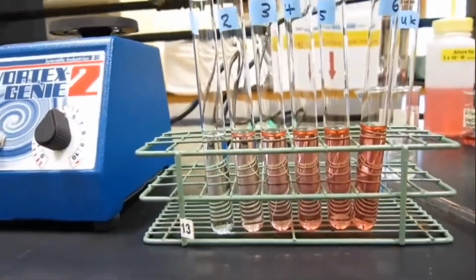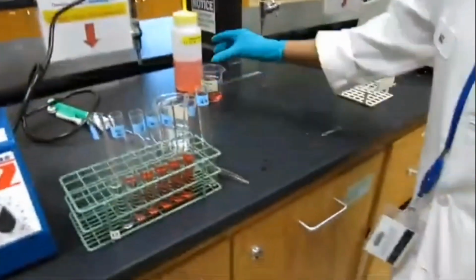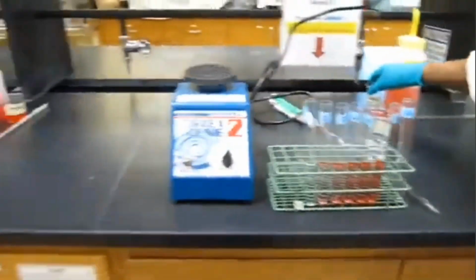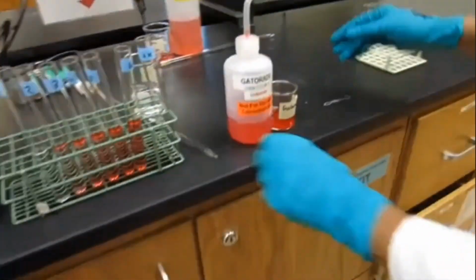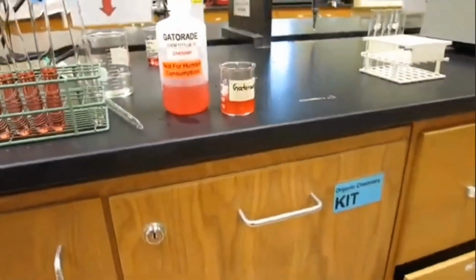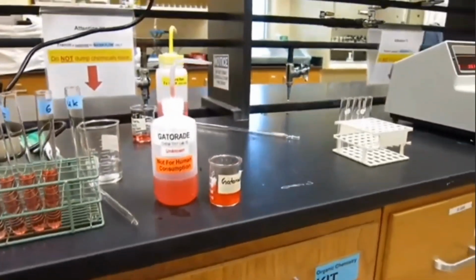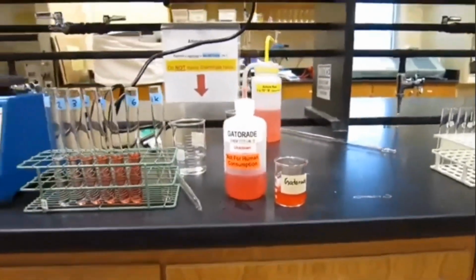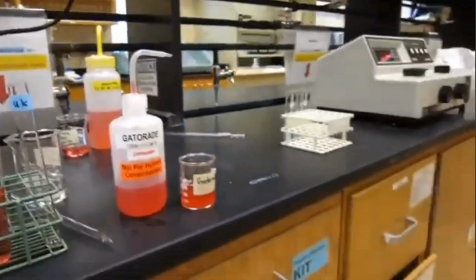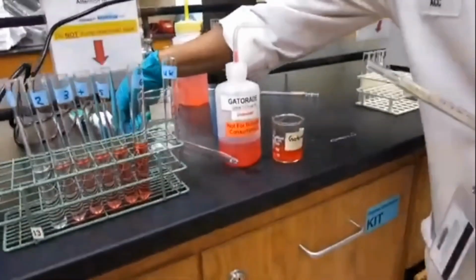The first one just the water, 2, 4, 6, 8, 10. So we can see that the concentration increases, intensity of the color increases because we have more Allura red towards the end. And we are going to find out the amount of Allura red in a Gatorade sample. So that is the purpose of our experiment.